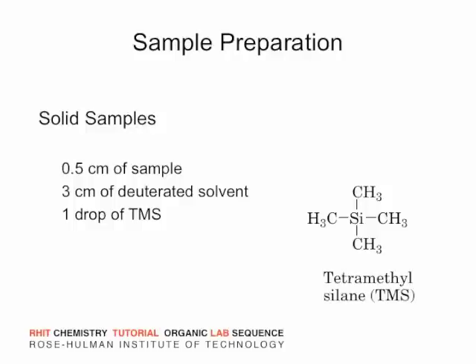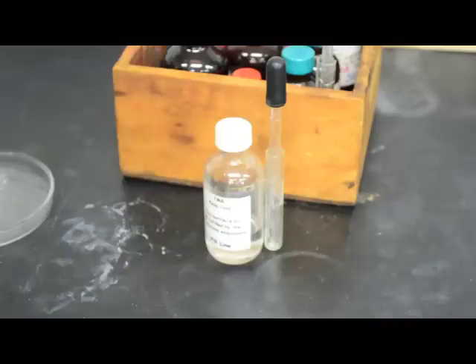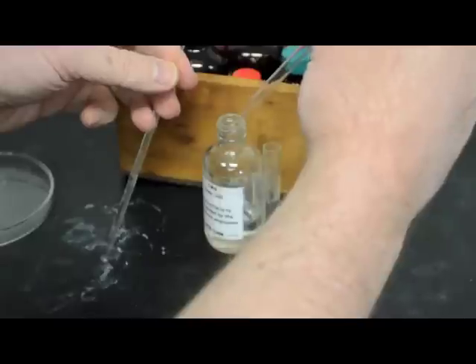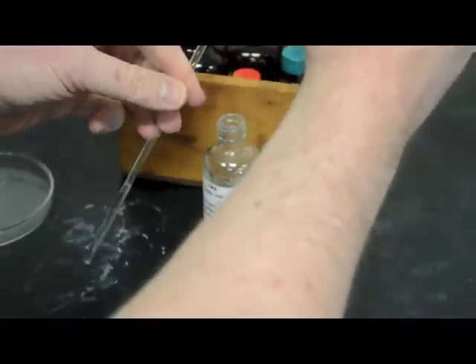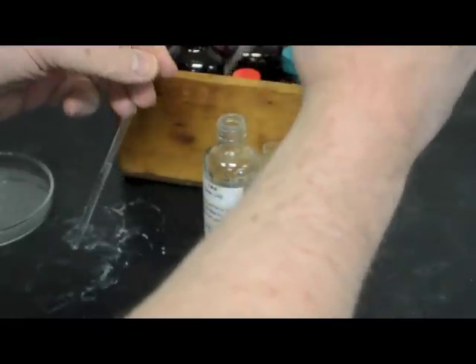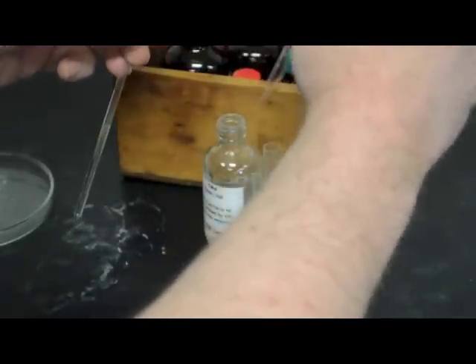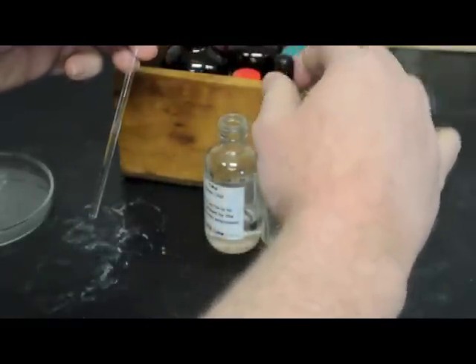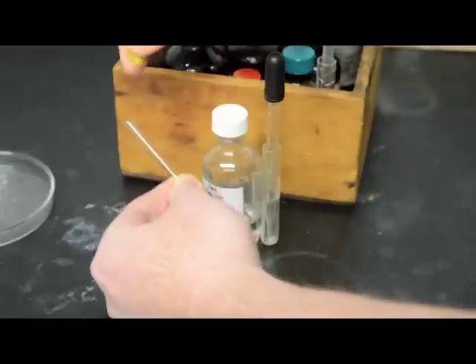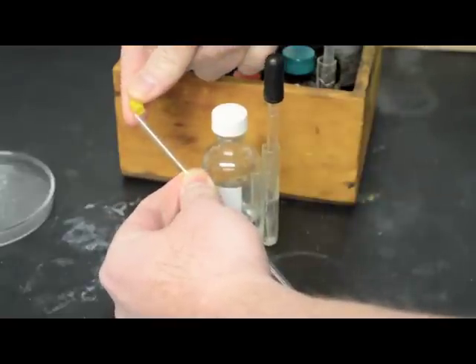The internal standard we will use is TMS, tetramethylsilane. Add a single drop of TMS, adding too much will distort your data. Place a cap on the tube and vortex again.